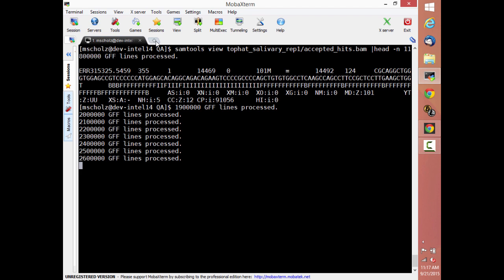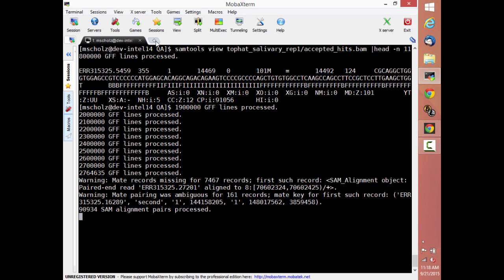We are right now, while it's running, taking a sidetrack from there. There are a bunch of different pipelines you can take for RNA sequencing analysis. The one that you will find if you go to the TopHat webpage is to use Bowtie, TopHat, Cufflinks, Cuffdiff, CummeRbund, etc. to analyze your data. There's not necessarily anything wrong with that pathway. I'm choosing a different pathway.